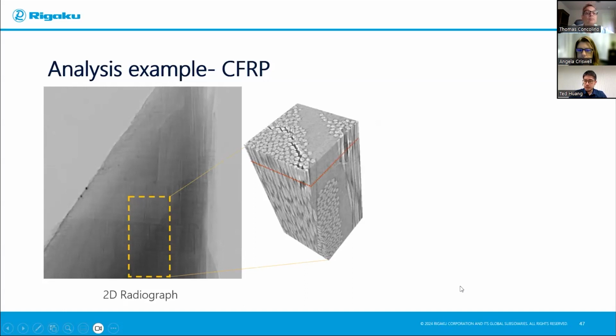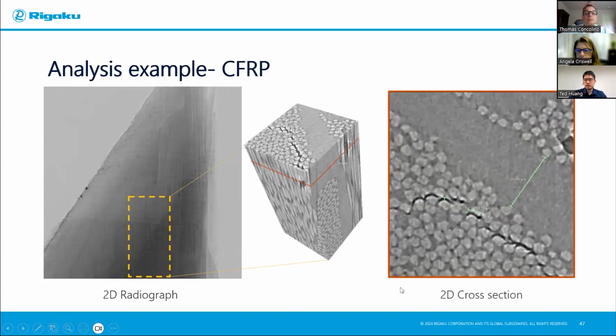And if you do a 2D cross-section view, this is something you will probably see if you were to do a 2D SEM. With SEM, you have higher resolution, sure, and you can do similar analysis like the 2D measurements I did on the right, but you will never be able to tell how deep the cracks are going into the fibers and how devastating or how connected this crack network might be, right? So using X-ray CT, you can get the answer to that question by doing segmentation.